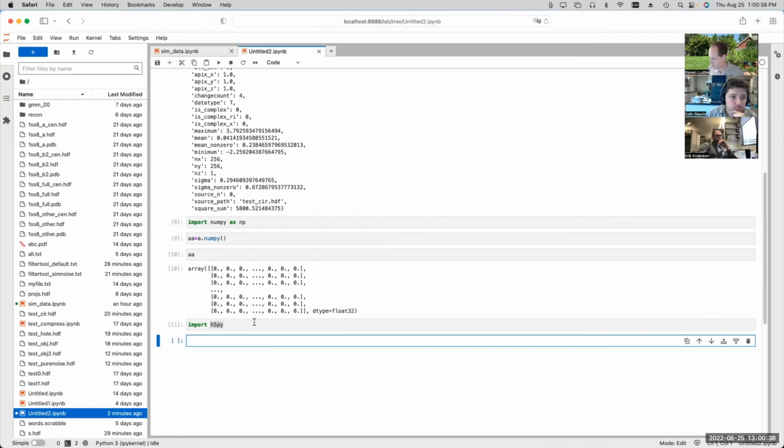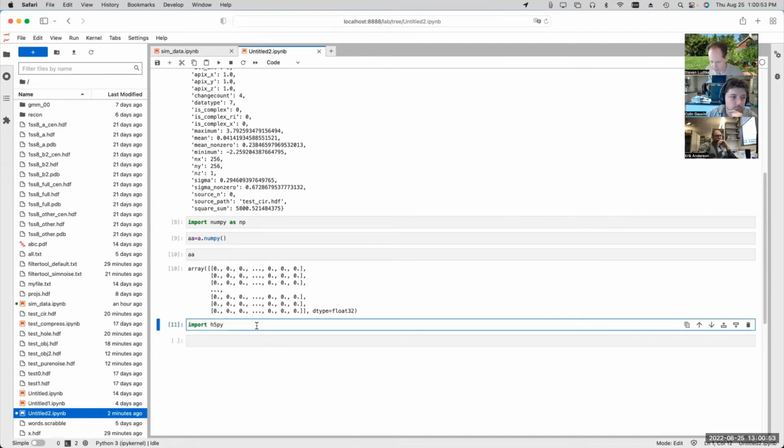Chimera definitely has support. Chimera added support like 12 years ago for the EMAN style HDF5 files following the same white paper. So you definitely can take EMAN2 HDF files and read them directly in Chimera, which is very convenient.